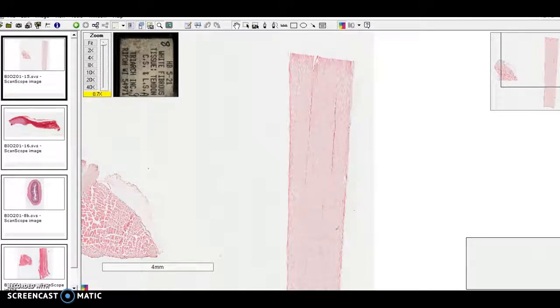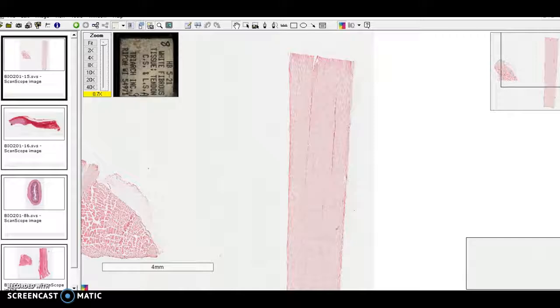But this is simply parallel collagen fibers interspersed with their fibroblast creators.